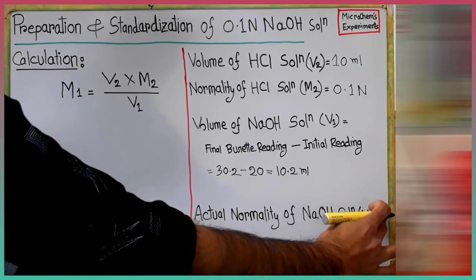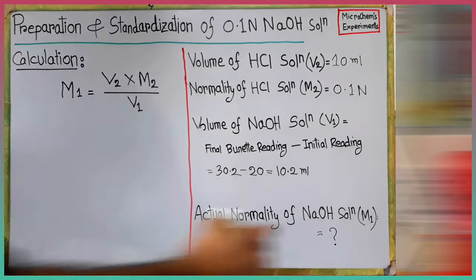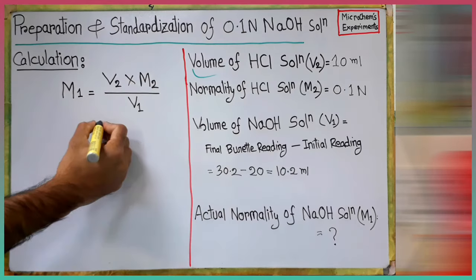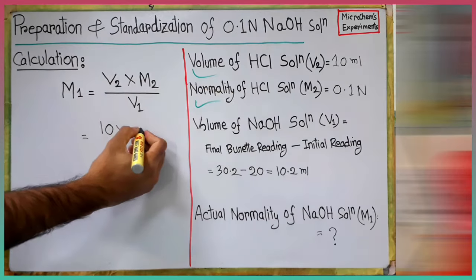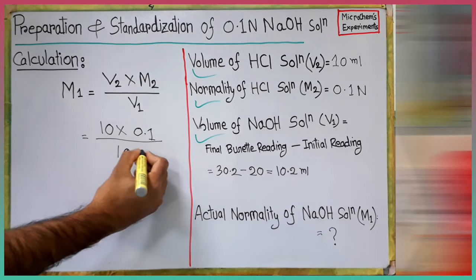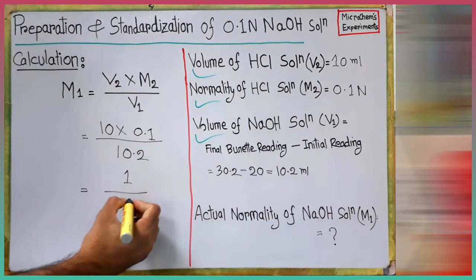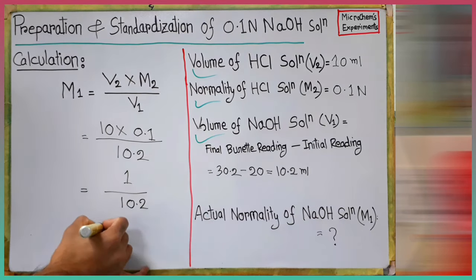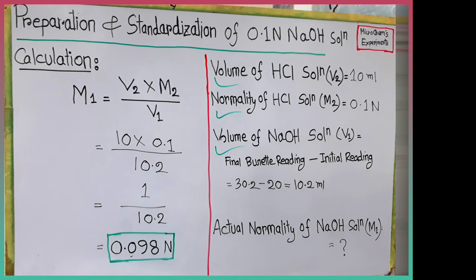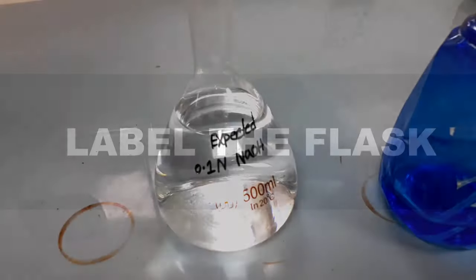Now we have to find the actual normality of the newly prepared sodium hydroxide solution. Let's put the values in the equation given in the left side of the board. By solving the equation, we get the actual normality of sodium hydroxide solution is 0.098 normal. Let's correct the label of the flask containing sodium hydroxide solution.